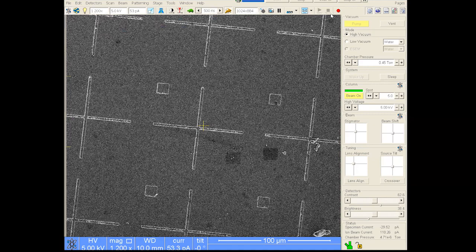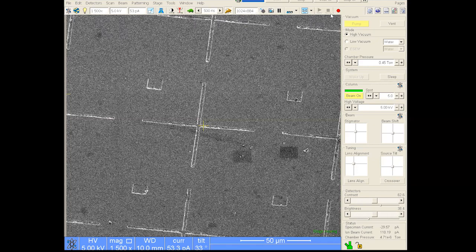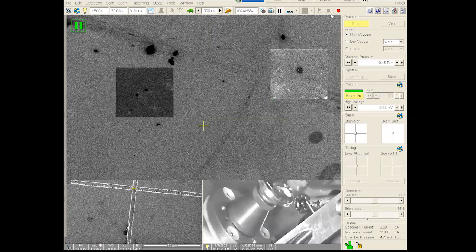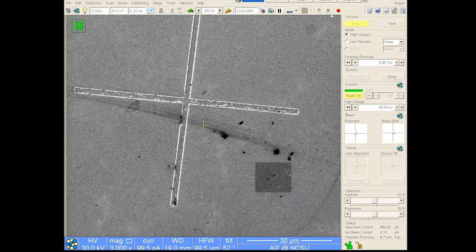These next tips will be more concerned about patterning. I just want to make sure that people understand them a little bit, because it's, again, trying to get you to do things a little bit quicker. So let's go back to the ion beam. Okay, F9 adjusts our contrast. F6 to pause.